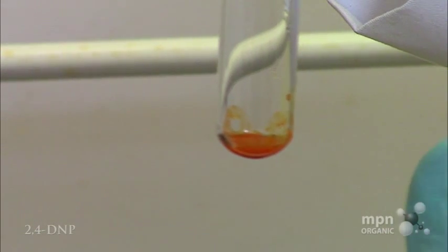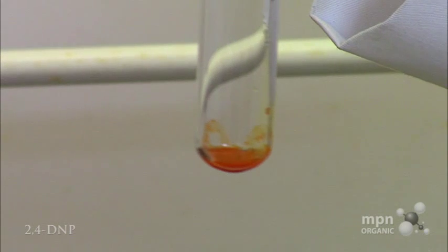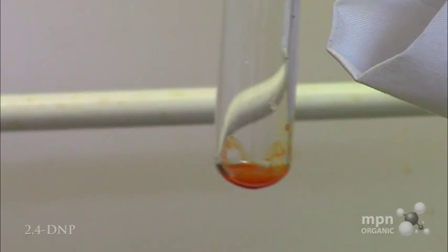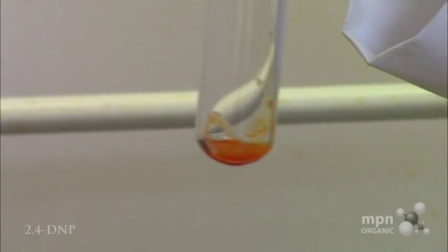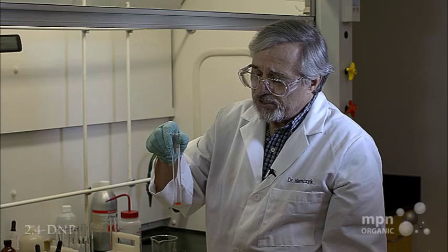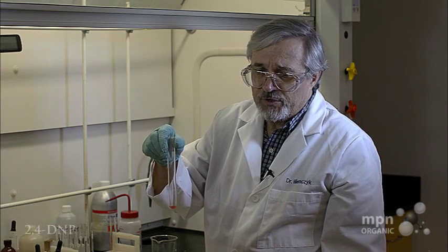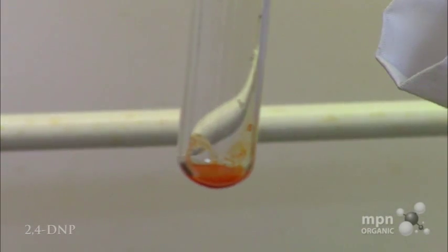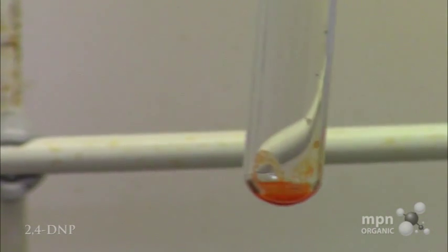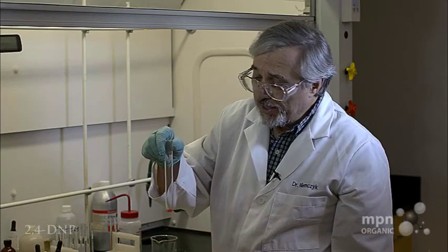Now what you would do then with this is take this material and suction filter it, then recrystallize it, and then take a melting point of it. That would be the way that you could identify this as para-anisaldehyde, because the 2,4-DNP reagent forms what we call a 2,4-dinitrophenylhydrazine derivative with the aldehyde, and that is the orange solid which you see right there.